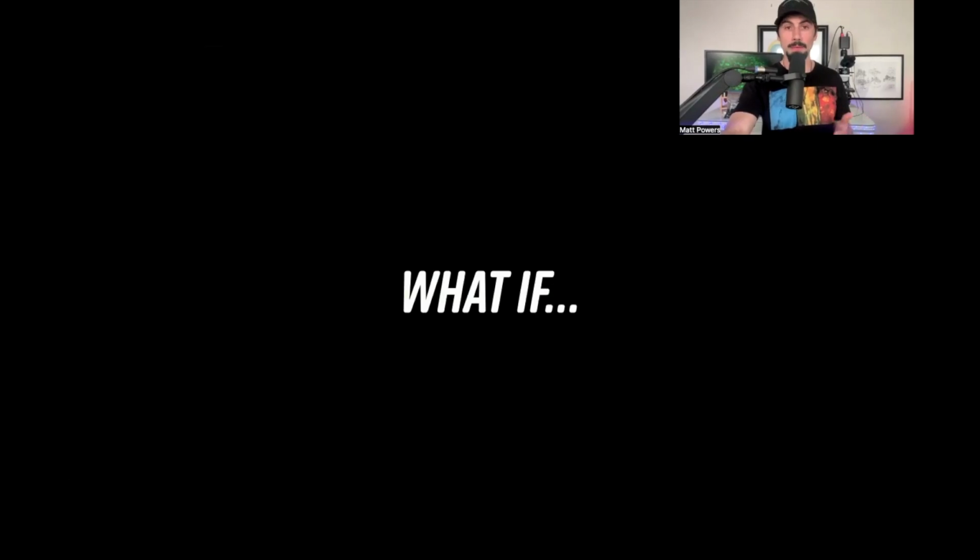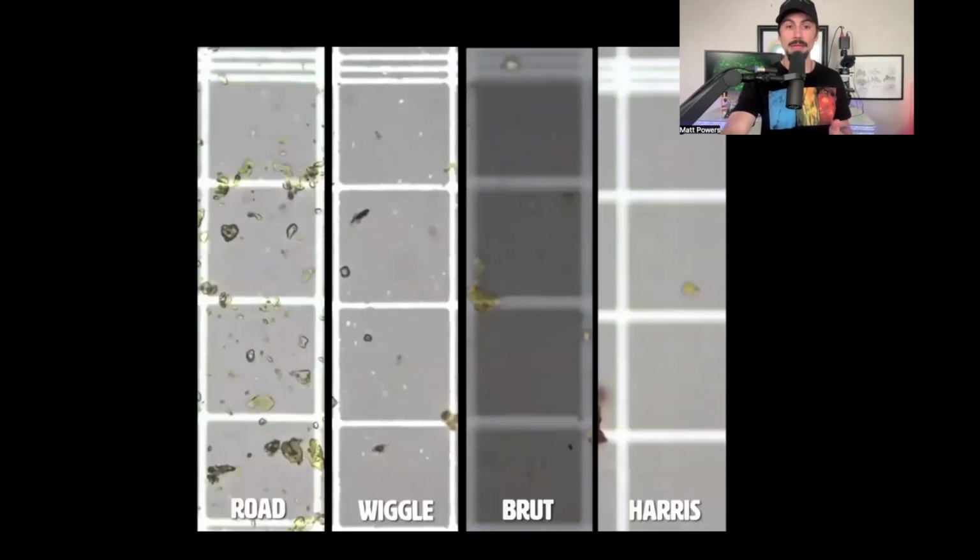So what does that mean? That literally means that you can stain and see the amount of life there by the amount of color. The darker it is, the more the dye is absorbed by the actual life, the more life you have. So the darker it is, the better. And I was doing a stain to just see the life and count by going down to that individual square and counting the living bacteria. And then I discovered this.